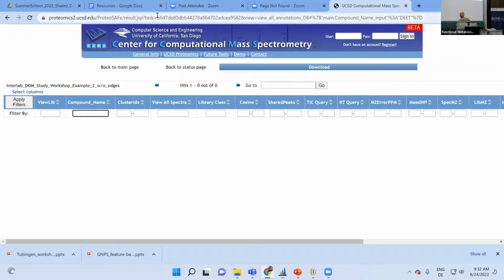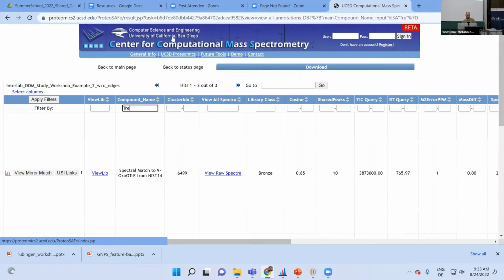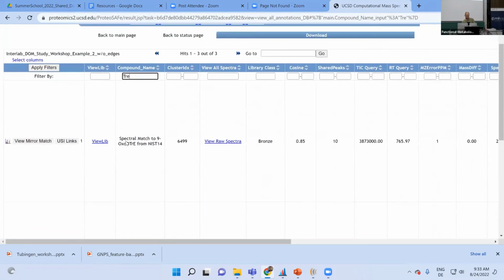Which one? Mm-hmm. Like this, tree? 300. Oh. No.